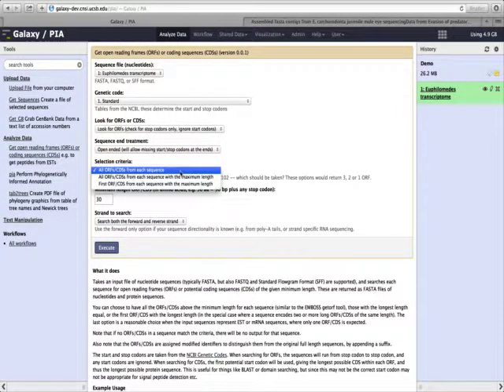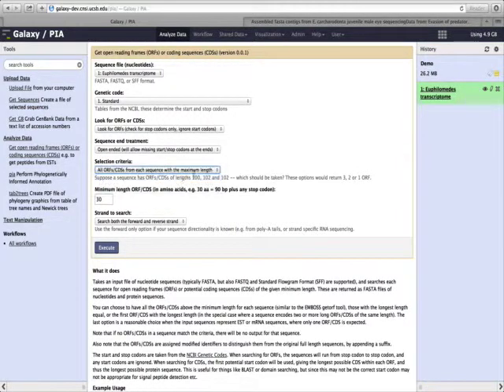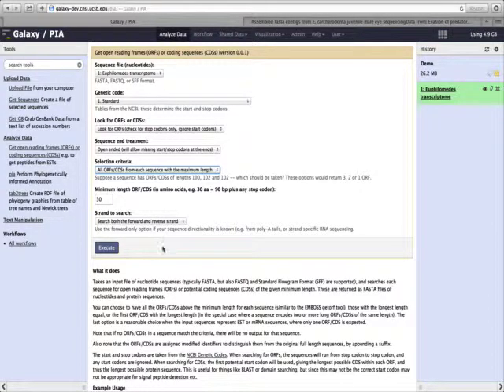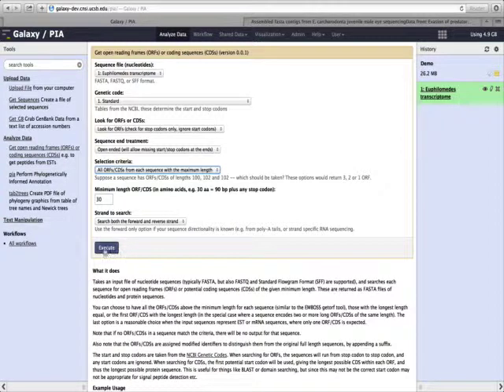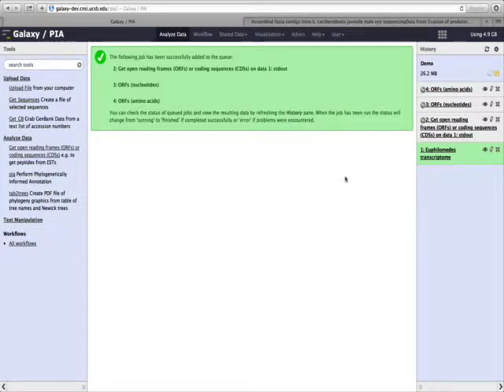I will keep only the biggest open reading frames from each sequence, and they must be at least 30 amino acids long. I'll search both forward and reverse strands because we don't know which direction they are in this transcriptome. Then I'll click Execute. This tool will take a few minutes to complete.